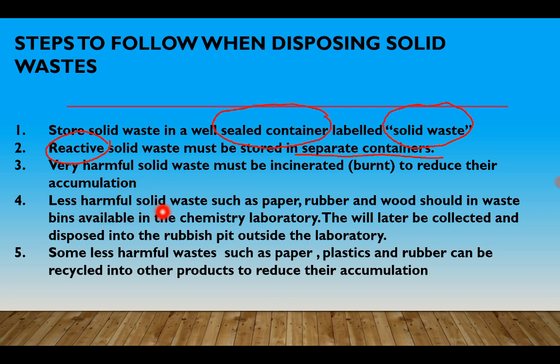Less harmful solid wastes such as paper, rubber, wood should be placed in waste bins.